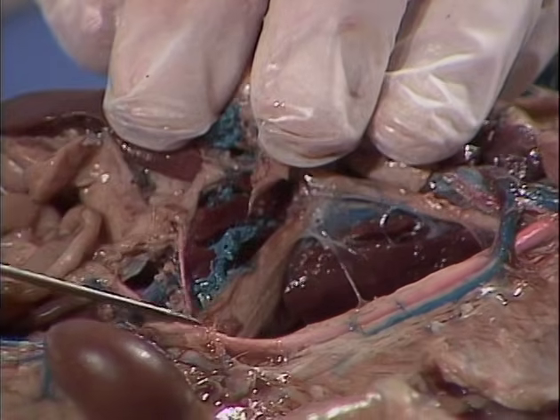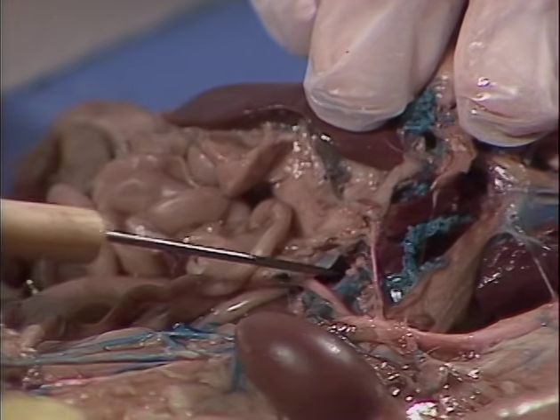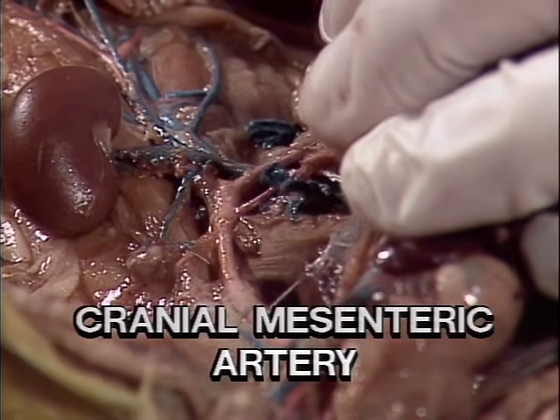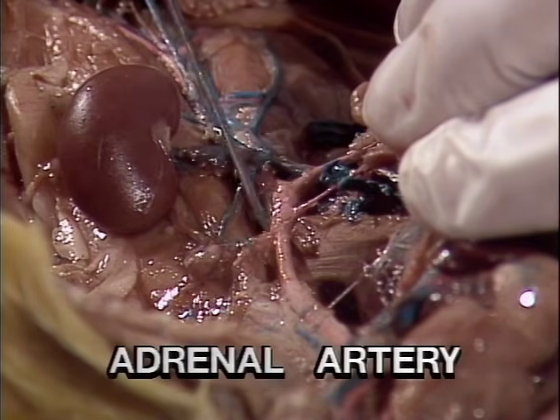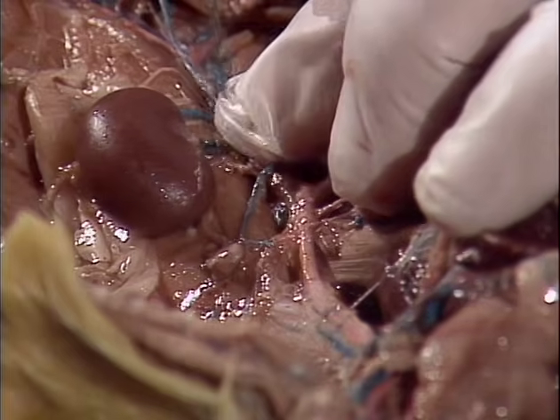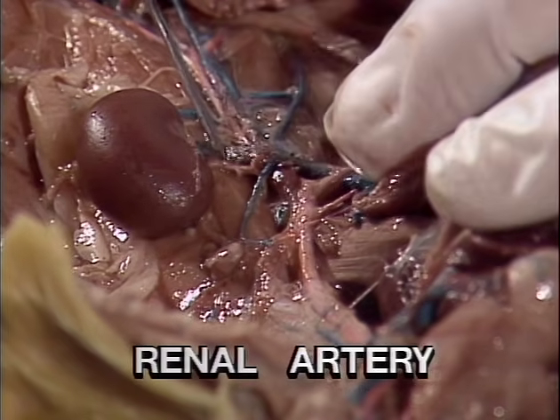Along the aorta, we see several branches going into the intestines and the mesentery. These are the celiac artery and the cranial mesenteric artery. This artery is going to the adrenal gland and is known as the adrenal artery. There's also a renal artery going into the kidneys.